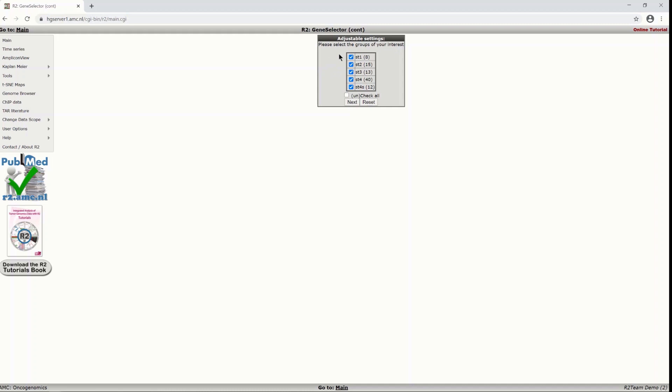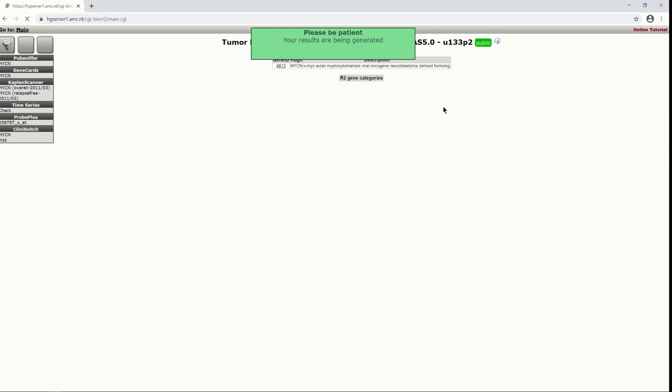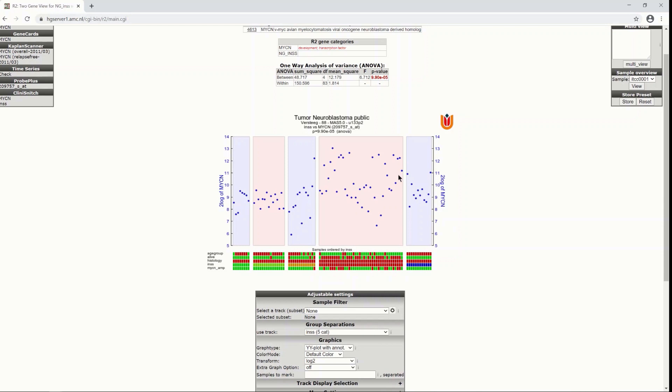Here I could select only a few of the stagings but I actually want to see the expression in all of them. So I click next again. And as you see this kind of blob of expression points for each sample one dot shows that stage four, which you can find here, that there are more samples in stage four that show high expression of MYCN.